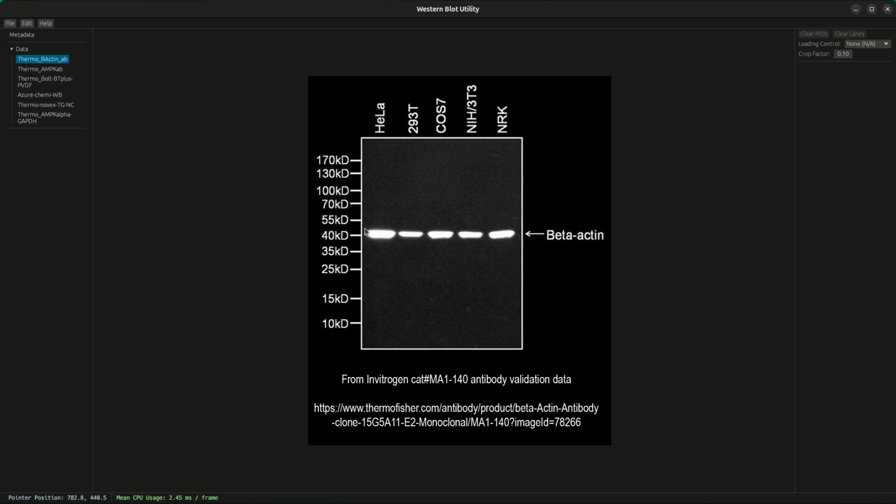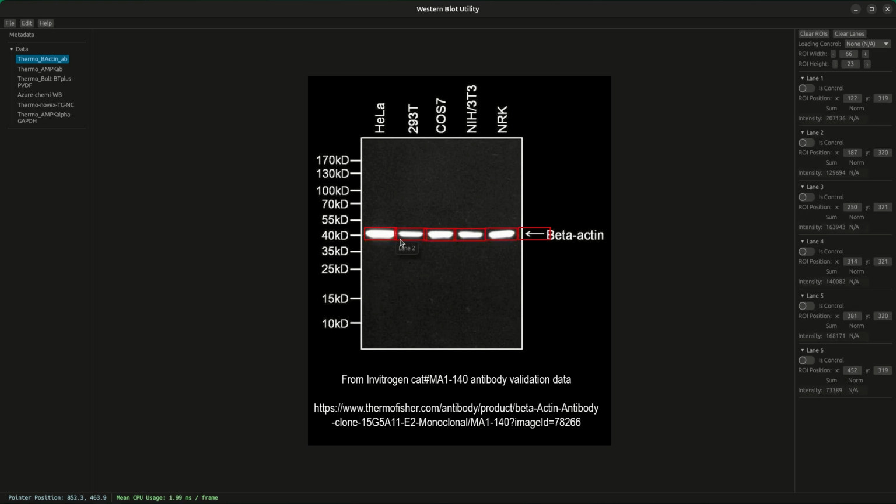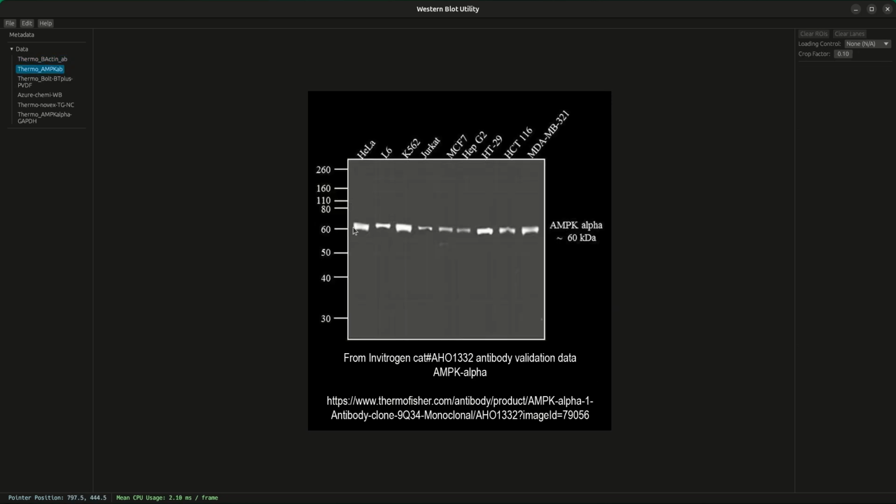So without further ado, I'm going to click and drag to create my reference ROI. It's very helpful to keep this tight. And then here, once again, I have a miss, like that's to be expected with the heuristic algorithm. And so let's keep going.